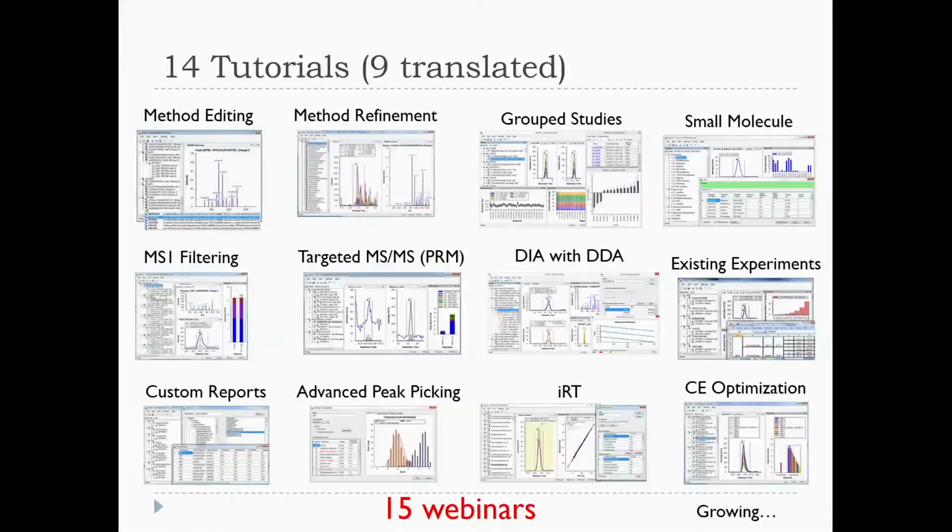There's quite a lot of documentation for Skyline. So your education doesn't have to and shouldn't end here. There are all these tutorials to work through. We've been doing a webinar series. We encourage you to attend those live, but also go back into the archive, because they're all recorded, and they're all organized to be done sort of like the SkyJam hands-on session you did this morning. We provide all the data. You can download it, and you should be able to go through step by step.